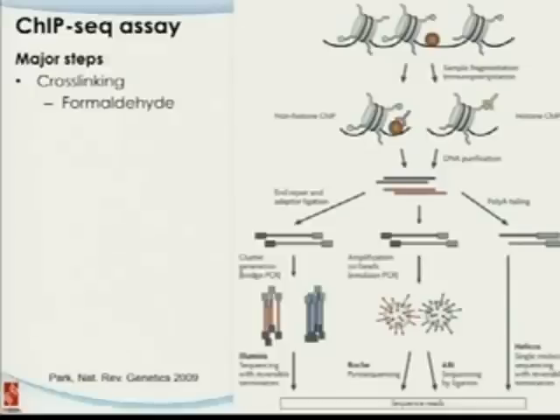The reason I put it here is it's pretty, and it really gives you the idea of what we are doing. So you can see that this is a histone, and the DNA is wrapping around it. And there are different histone modifications. And also, there are the transcription factors that bind in those regions, so other DNA binding proteins. So the point of this part is once you design the antibody, you can either target this transcription factor or DNA binding protein, or you can target this histone mark. And then you get the fragments, and then you sequence them.